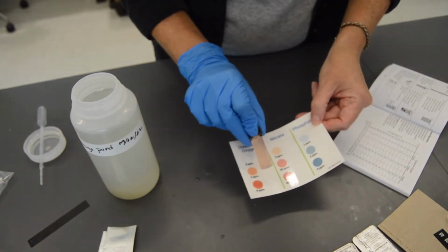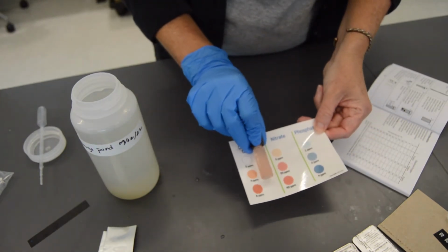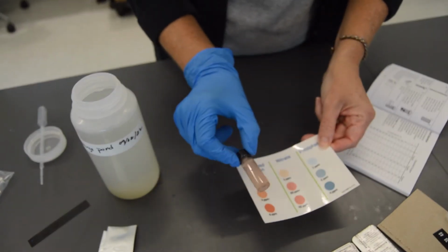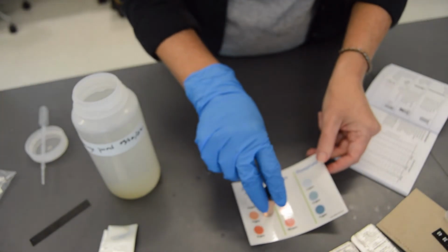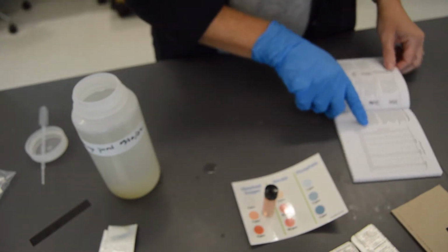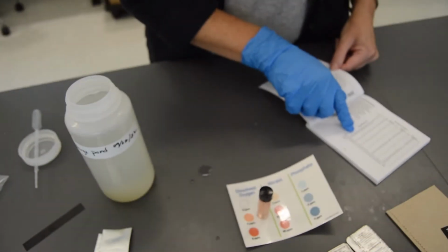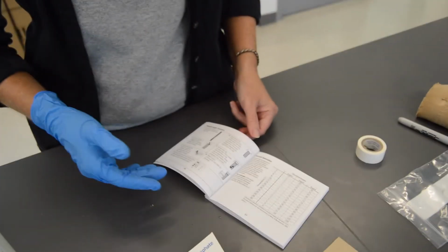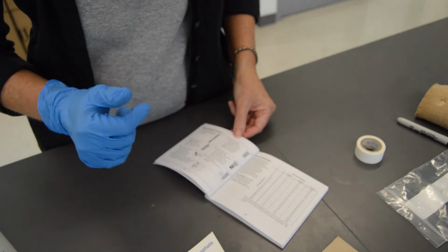All right, so we've waited the time for the color to develop, and so we see that we're at about 4 ppm for our dissolved oxygen. And we had measured 26 degrees. And so when we take a look at our chart, 26 degrees at 4 ppm means we're at about a 49% saturation level for the water, which is not bad.